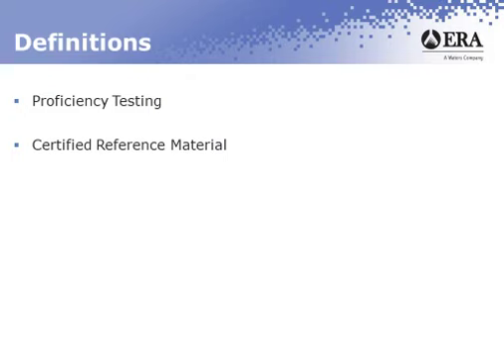Certified reference materials, also known as QCs or quality control standards, are standards of a known value, used as a check on your internal quality control processes. These are the samples that do not need to be reported back to ERA. CRMs or QCs can also be used for demonstrating analyst capability or used to troubleshoot instruments and or method issues.